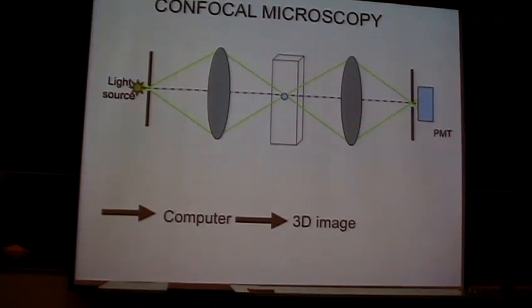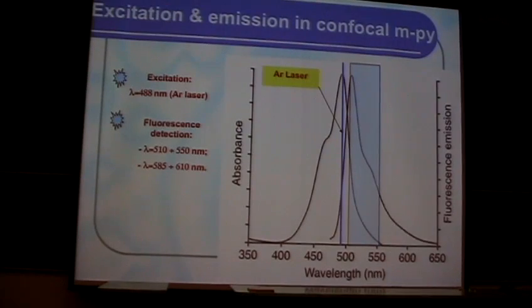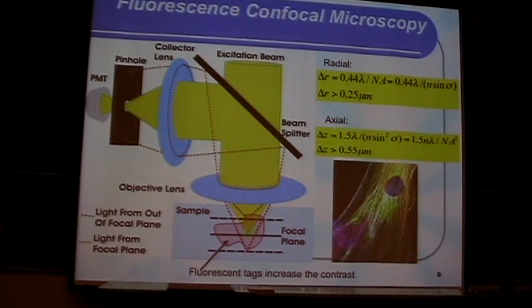in which instead of the regular light source like in the original approach proposed by Minsky, one uses excitation beam in the form of laser light. Therefore, you do not need to use one of those pinholes for excitation.